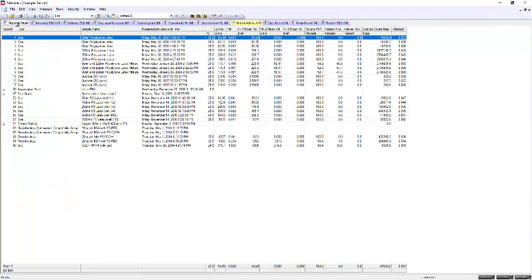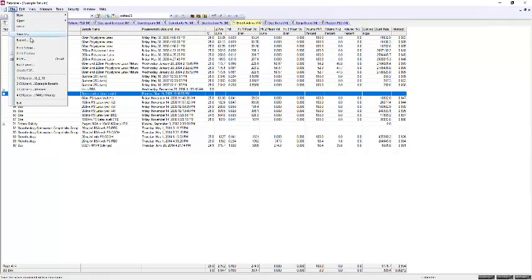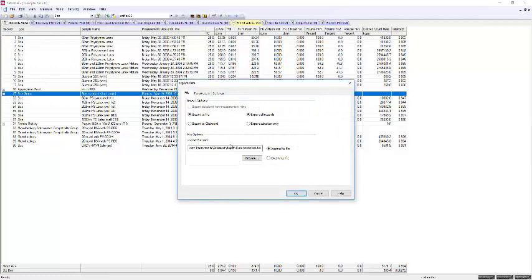Another way of exporting in the software, if I want to export everything that you see here, is to go to File, Export, and then you can set up your own template of what parameters you would like to export and where you would like them saved. So you can do a batch export, which exports them to a CSV file.